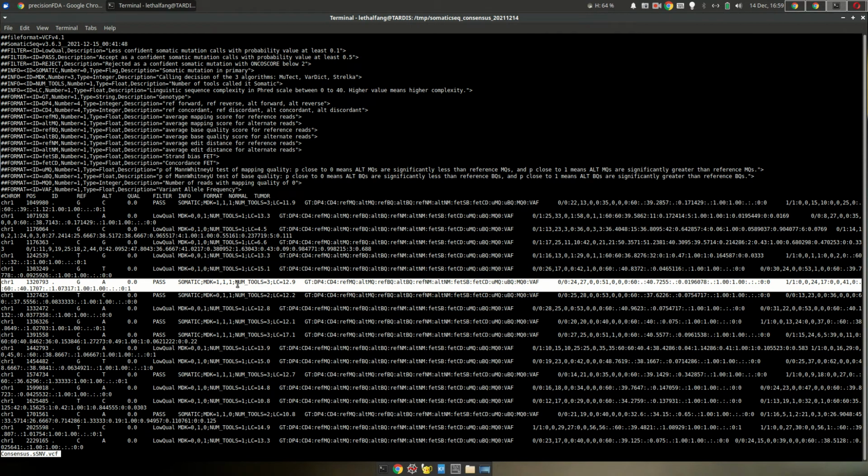This call, whereas all the callers have called it. So that's how you run SomaticSeq on precisionFDA.